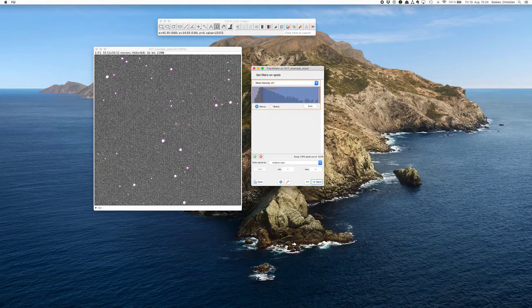So if I play around with this and you pay attention to the circles here around the molecule candidates, you can see that if I move the filter to the right towards the higher intensities, we get rid of the low intensity guys. So here, for example, these spots, where hardly any molecules are visible, we can get rid of by just moving this threshold a bit towards higher mean intensity values. So I think this is quite nice.